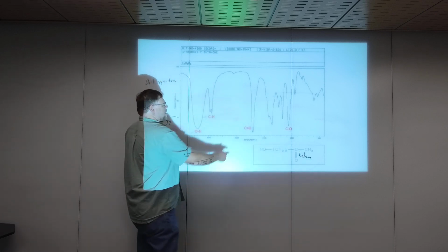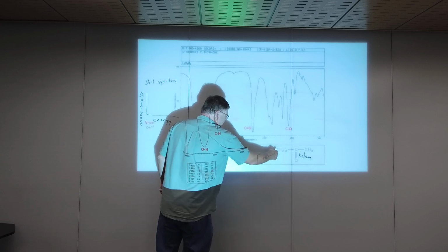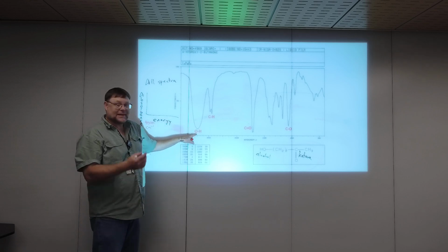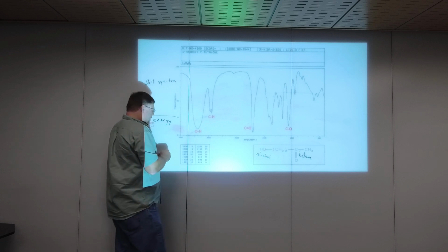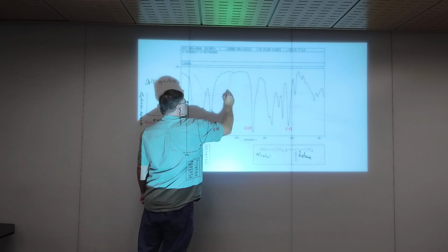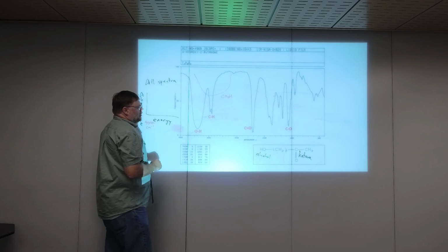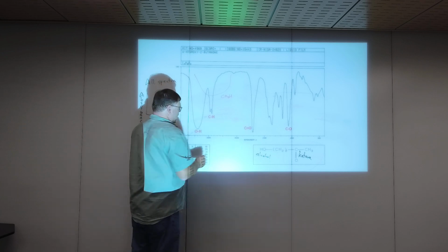So we have a ketone, a carbonyl, and an alcohol. sp3 COH. So again, this molecule has CH bonds. It's got an OH, but it's an alcohol OH, so it's not super broad. The carboxylic acid, you'll remember, sort of did that. The OH is actually deeper but narrower, the alcohol OH. And then you've got CH, carbonyl, and CO.